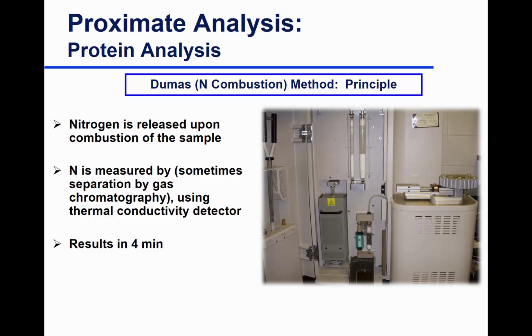From there, the samples move through the reduction tube in the furnace here. And what happened in the reduction tube? Who remembers what took place there? That's where the copper is. What was that? Isn't that where the copper is? That is where the copper is. So what happened in the reduction tube? Like nitrous changing into nitrogen. Yeah, so the nitrous oxide species are reduced to nitrogen.